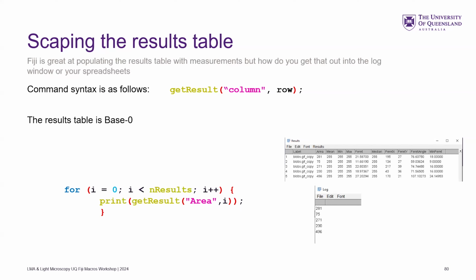Then you do it again. Then you have to scroll down your 57 nuclei that it found, and copy that into Prism. That gets tedious. So if you do the work here, and you scrape all the ones into one big long string that's easy to use, it can be a future time saver.